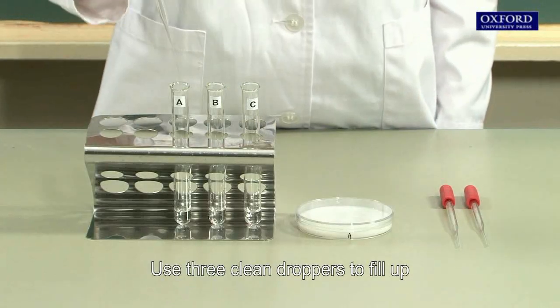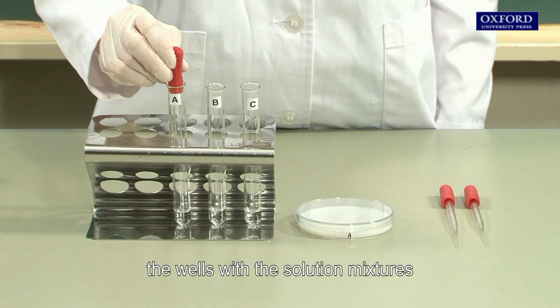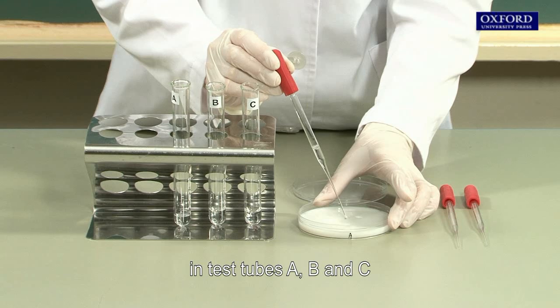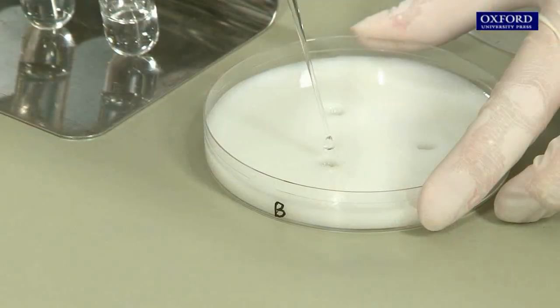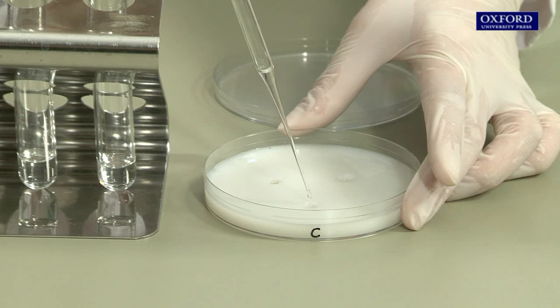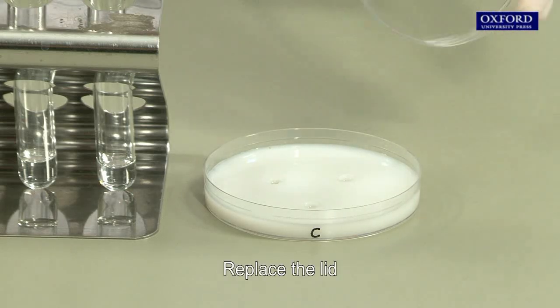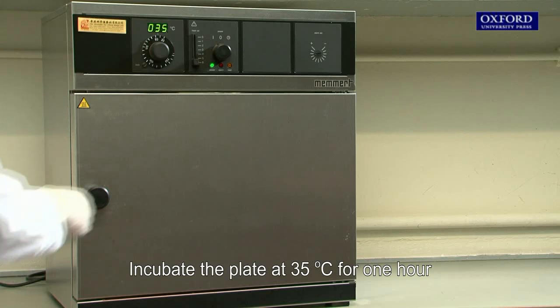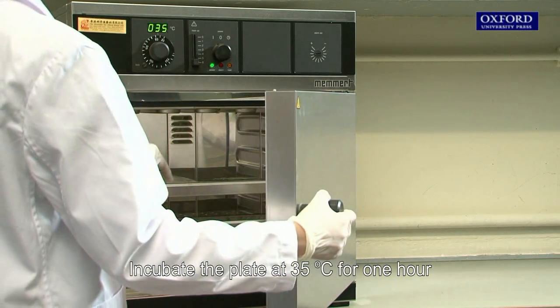Use three clean droppers to fill up the wells with the solution mixtures in test tubes A, B, and C. Replace the lid and incubate the plate at 35 degrees Celsius for one hour.